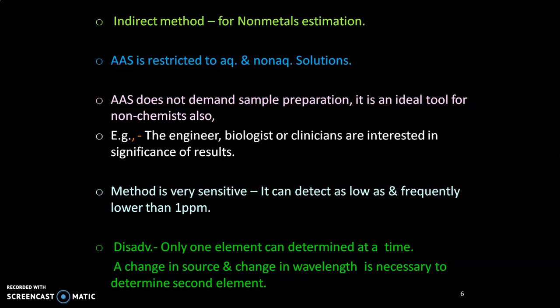Atomic absorption spectroscopy does not demand sample preparation. It is the ideal tool for non-chemists also. Example: engineers, biologists or clinicians who are interested in the significance of results. That's why it is a direct tool for these other fields also.